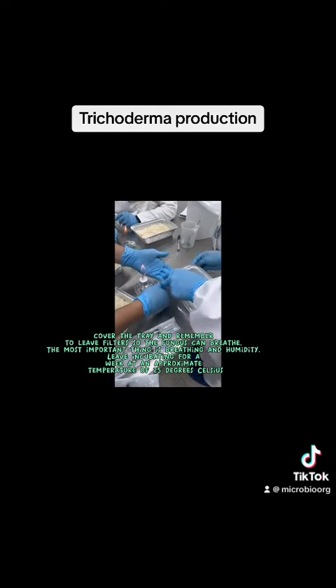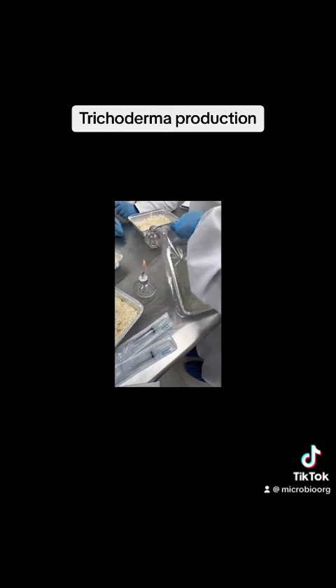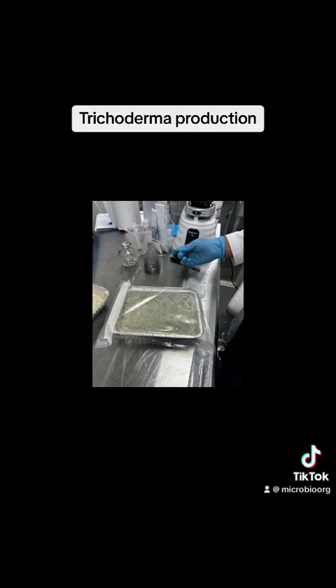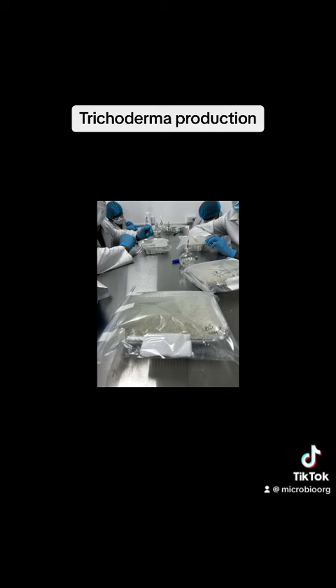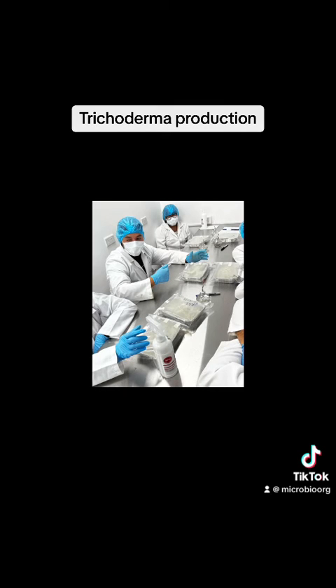Cover the tray and remember to leave filters so the fungus can breathe. The most important factors are breathing and humidity. Leave incubating for one week at approximately 25 degrees Celsius.